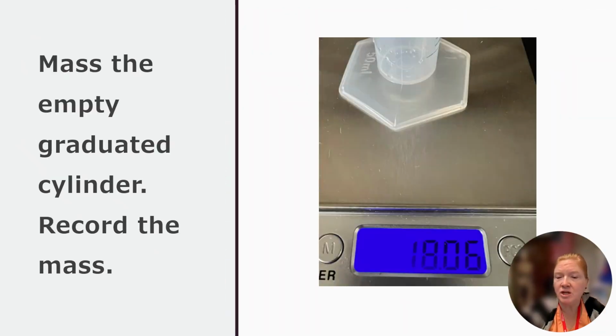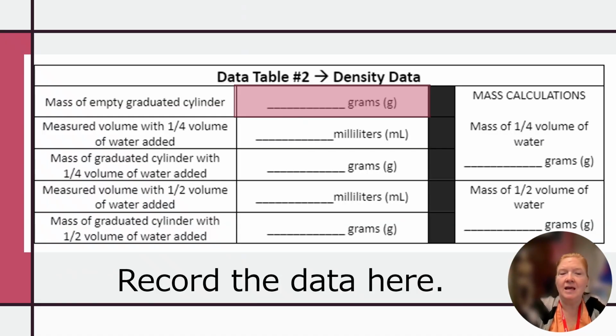Then you are going to take your empty graduated cylinder and record the mass. Now, if you are absent, you are going to use this data. If you are present in lab, then you are going to do your own data. That gets recorded in the table right there.